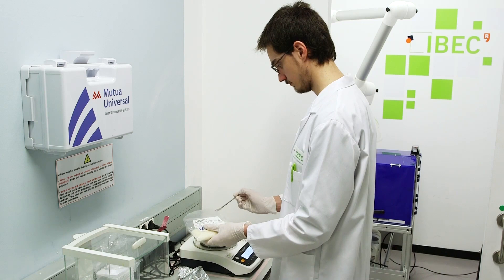Prepare the 2% PLLA solution by adding 200 mg of PLLA to a pressure tube.